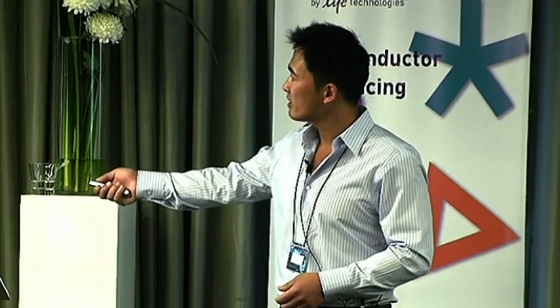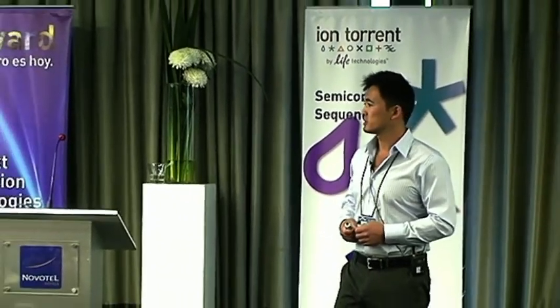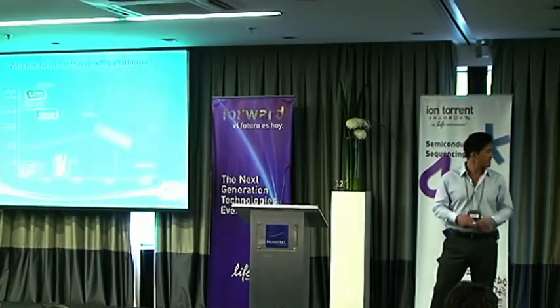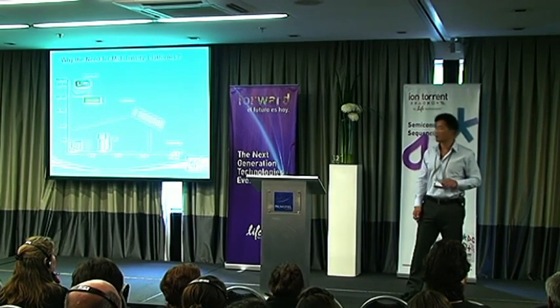Obviously, at the very, very high end, to get a full hypothesis-free look at a sample, basically, next generation sequencing is going to achieve that for you. And that's what we have depicted on the top there. On the x-axis, going across, that's the number of samples that could be interrogated by a researcher.